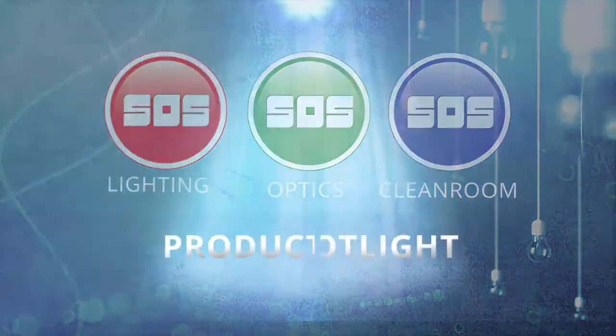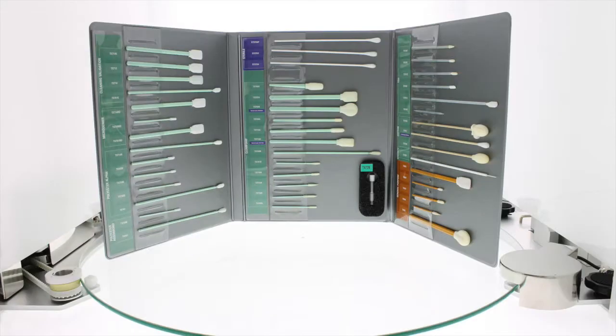Welcome to this SOS product spotlight. This video is one of a series featuring Texwipe products. Texwipe cleanroom swabs are manufactured with a complete thermal bond eliminating adhesive contamination. These swabs are manufactured using a high precision automated process resulting in swabs constructed to exact and consistent tolerances, and are lot coded for traceability and quality control.